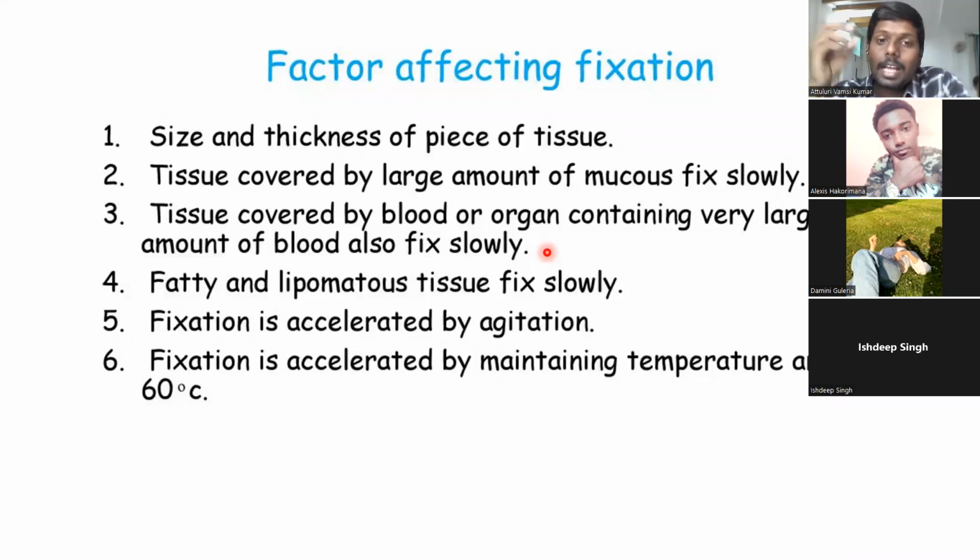Fixation can be accelerated by agitation, and fixation can also be accelerated by increasing the temperature. We already know that by increasing temperature, the rate of penetration of the fixative solution will increase, so the amount of time required for fixation will be reduced overall. But what is this agitation? It is the second approach, where upon suspending the tissue in the fixative solution, we constantly shake the tissue. With this constant agitation, the rate of penetration of the fixative solution will increase. That is how agitation will enhance the speed of the fixation procedure overall. So agitation is very important.